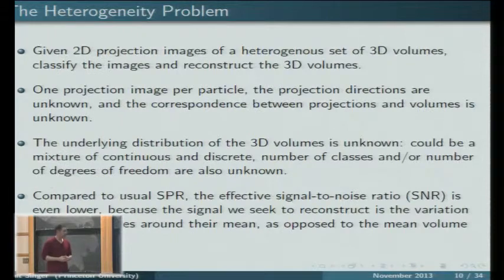So what are the problems we are facing? We have the same 2D projection images like before. We still have just one molecule, one image per molecule. But now molecules can actually look different from one to another. So if you thought before that the cryo-EM problem is challenging enough, and you didn't believe that it's possible, now it's even more challenging. That is, we are trying to recover not just one structure, but many structures from the same data set.